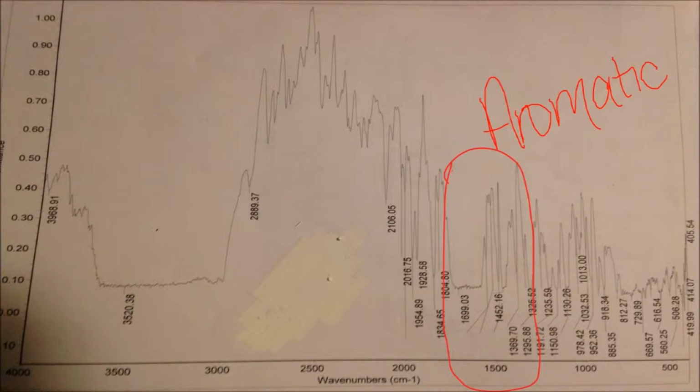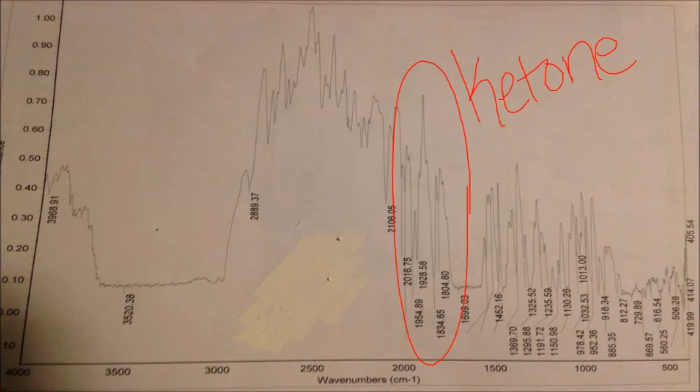To do this technique, you place a small amount of your unknown and a small amount of KBr in a mortar and pestle. The mixture was then ground into a fine powder and placed in a bolt between two wrenches and firmly packed. The small, thin layer was then placed in the IR spectrometer, and we waited for the results to be calculated. After they were calculated, an IR graph was shown. This was used to identify any functional groups that were present in the compound.